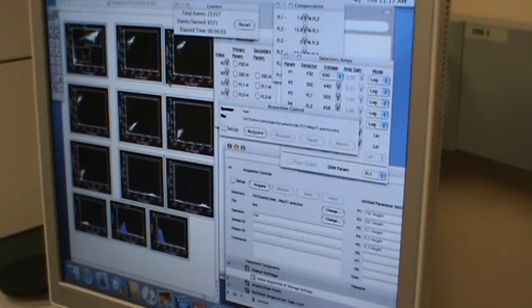Okay, now we are going to do the second one. That will be half-live, half-dead, I guess. So are all live cells going to be blue? Is that why that? No, the blue is a different thing. The blue actually just shows to highlight the peak. It doesn't mean it's blue. Okay.